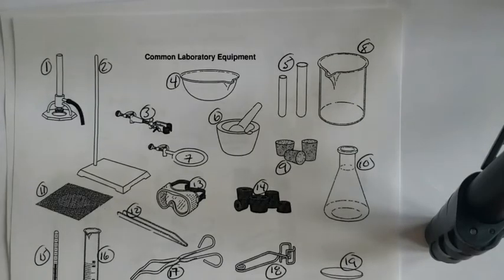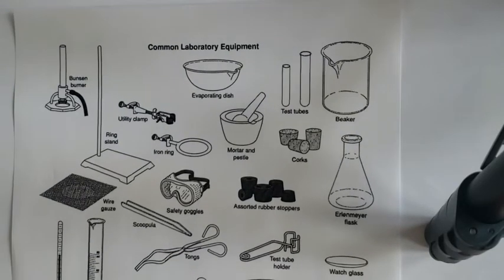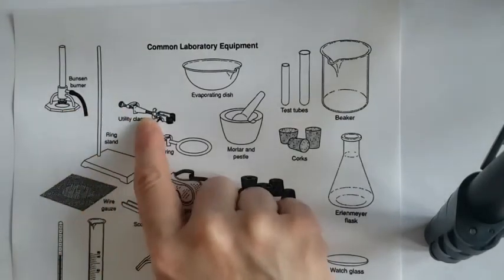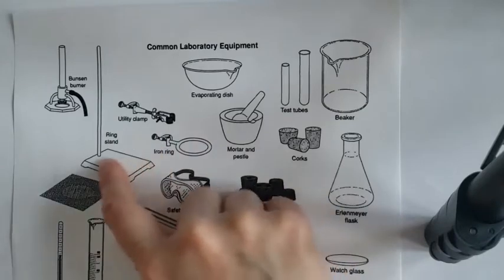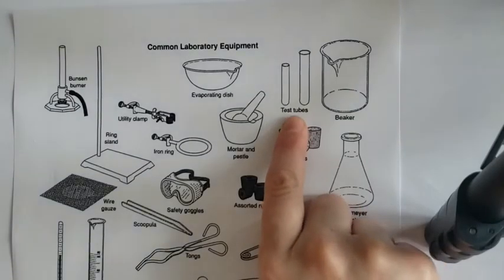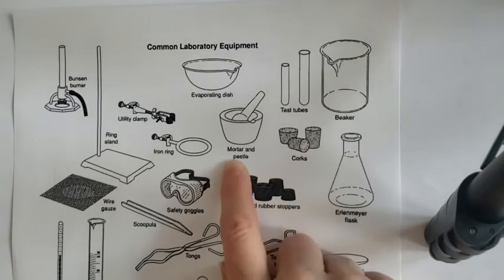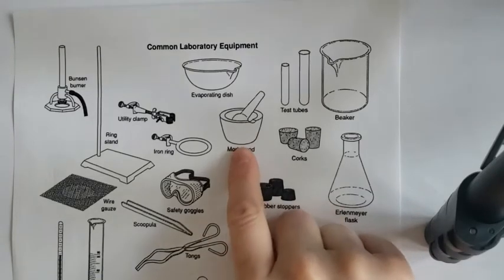So all the numbers correspond to a blank. And in case you're having trouble finding any of them, I'm just going to go through them very, very quickly. So this is a Bunsen burner, okay? Utility clamp. We use that, I use it, to hold test tubes on one of these ring stands. An evaporating dish is if you want something just to sit and we heat the bottom and let the water all go away. We know what test tubes are. Beaker, corks, and rubber stoppers kind of do the same thing. Mortar and pestle, that's if you're going to crush something. I have one of these in my kitchen.